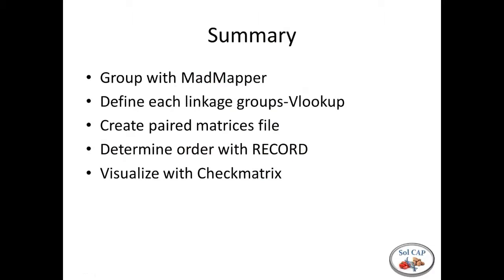So what did we do today? I know I'm speaking fairly fast. We used MadMapper to group markers. We basically massaged the data. We broke it up by linkage group using the VLOOKUP function in Excel. We created a paired matrix file for each of those linkage groups, and also an input file for REC by linkage group based on the groups.